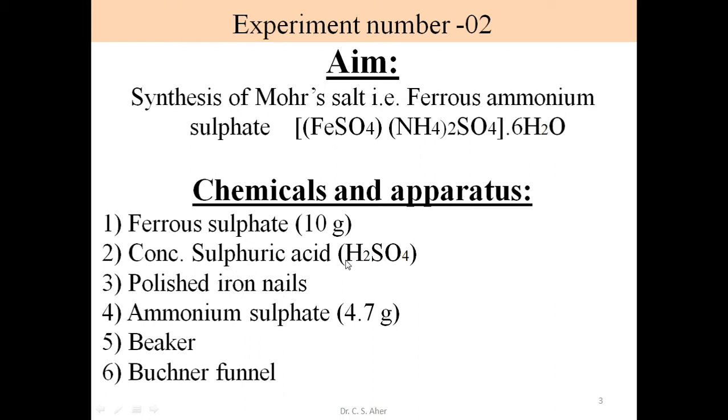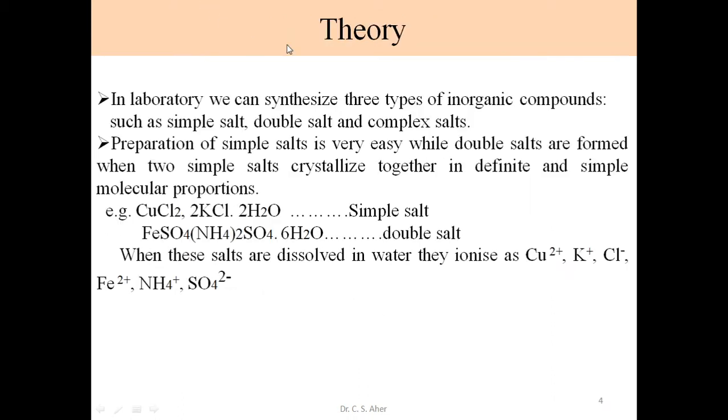Second is concentrated sulfuric acid, ammonium sulfate, 4.7 gram, beaker, and funnel. That funnel is a Buchner funnel. This filtration we carry out on a suction pump to drain out the water or liquid part and dry the crystals. So what is the theory? In our chemistry laboratory, we synthesize many inorganic compounds.